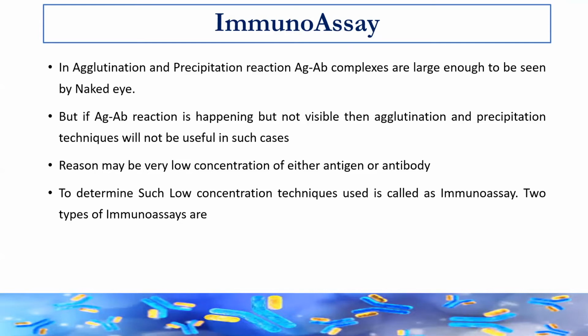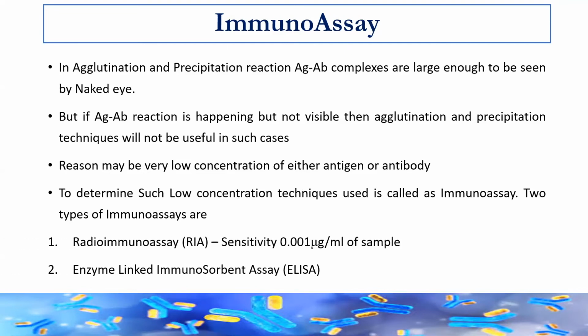There are commonly two types of immunoassays: radioimmunoassay and enzyme-linked immunosorbent assay, that is ELISA. Both techniques are extremely sensitive.